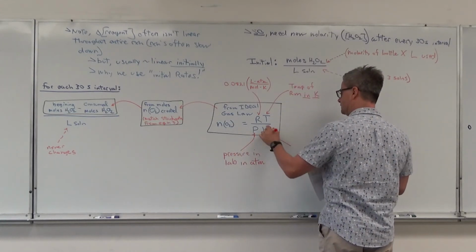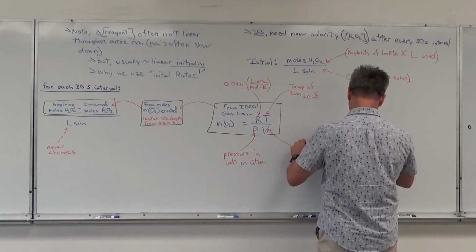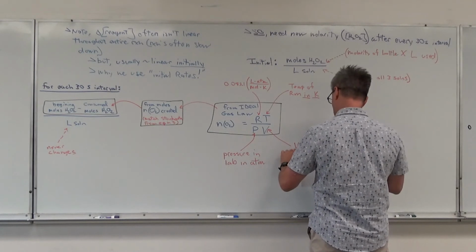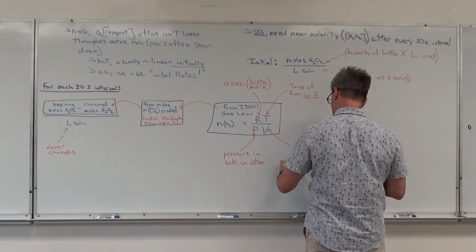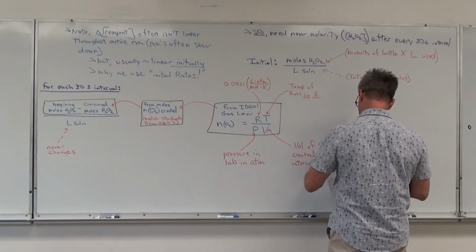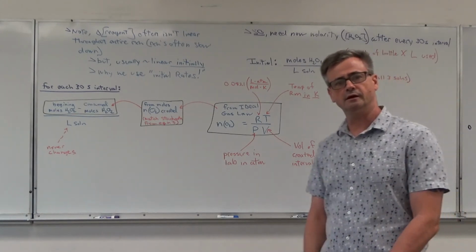Right, and finally the volume, that's the whole point of that complicated setup, is the volume of oxygen created over the interval in liters. Okay? Not too bad, right?